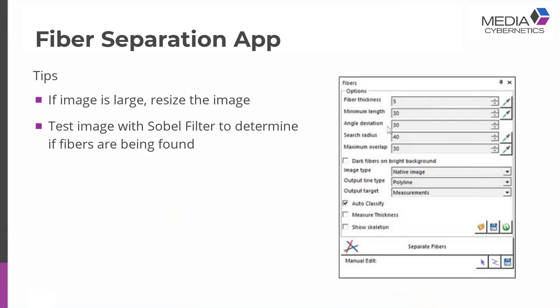As I mentioned, the Sobel filter is point number two. If you're really trying to understand why it's not picking up a fiber and everything seems right after adjusting settings, chances are the edge detection is failing. The easiest thing to do is run a Sobel filter as a quick test on the image — you can see immediately if it's picking up the fiber or not. Also, there's a fair amount of image processing going on — running Sobels, using count size, other operations — so if the image is large, the best thing to do is resize it. ImagePro has resizing tools; you can rescale the image and still keep calibrated units. If you're dealing with images that are 10,000 by 10,000 pixels or 5,000 by 5,000 pixels, you'll probably want to resize.